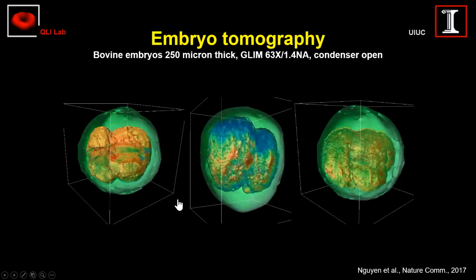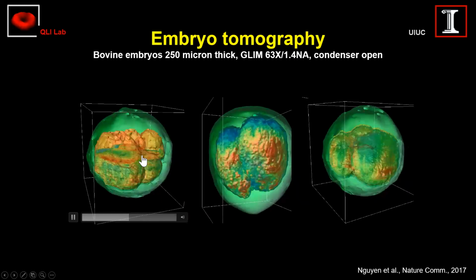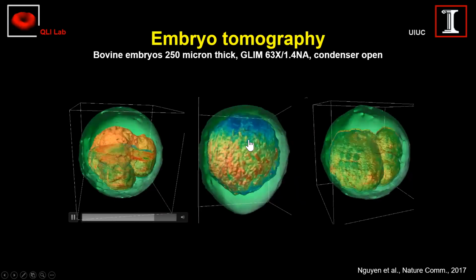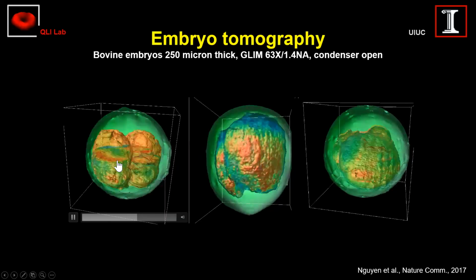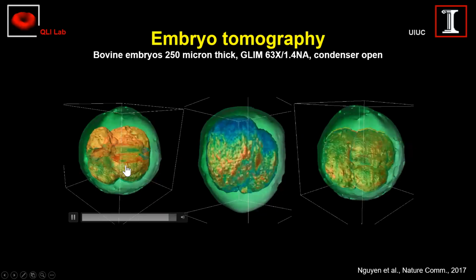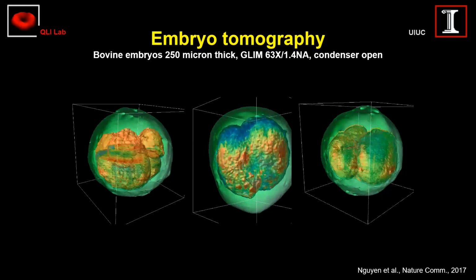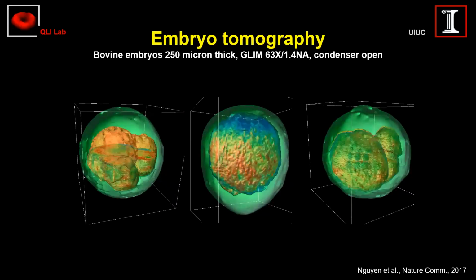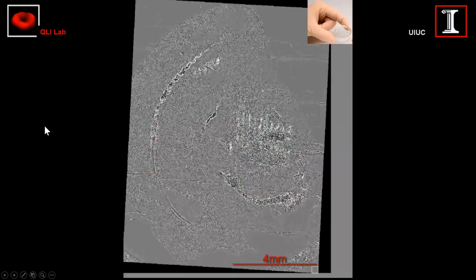So I was going to show here that you can actually make these images really nice. You can render them, and then counting the cells, you can quantify their size and mass. Cell count is actually one parameter that goes into the viability. So the normal embryo has to have checks in time. So at this moment in time, you should have this many cells and so on. So this could be wrapped into our intrinsic viability marker.